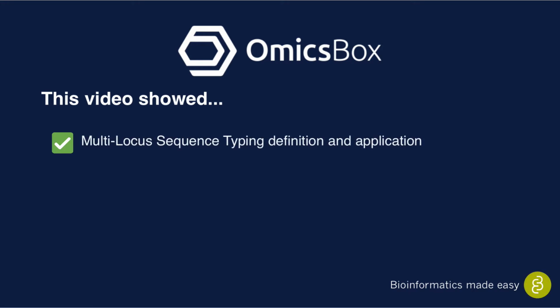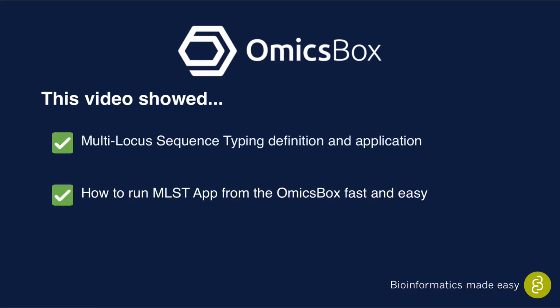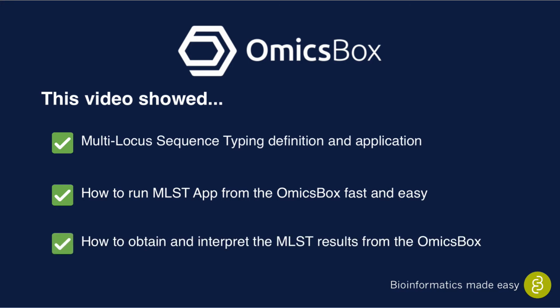This video shows the definition and application of Multi-Locus Sequence Typing, or MLST, how to run the MLST app from OmicsBox fast and easy, as well as how to obtain and interpret the MLST results from OmicsBox.